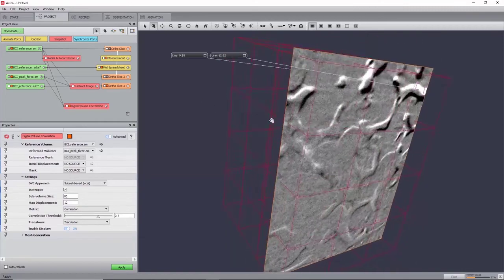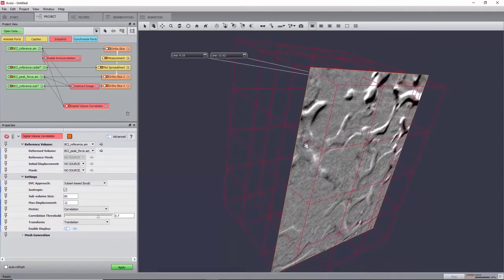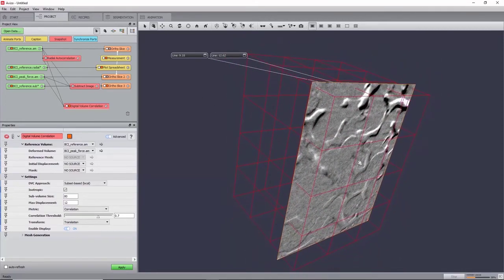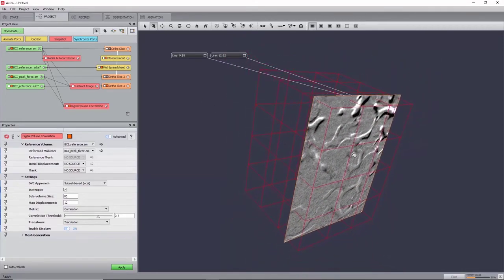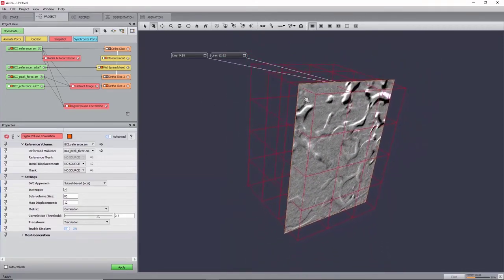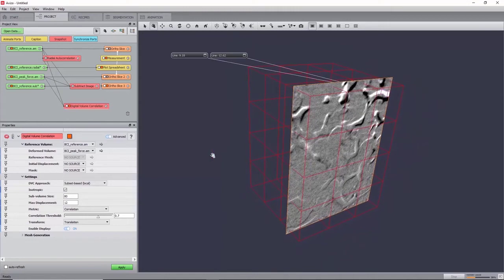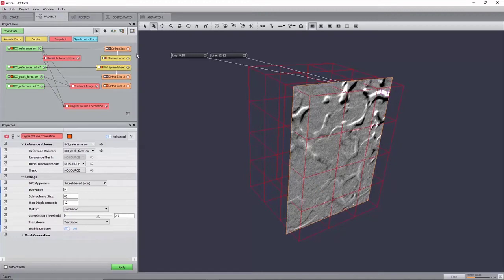You can now have a render of the subdivision into sub-volumes. Keeping the metric to correlation and the correlation filter to 0.7 will result in any sub-volume with a metric inferior to 0.7 to be ignored and interpolated instead.